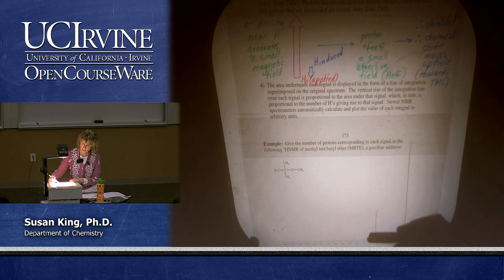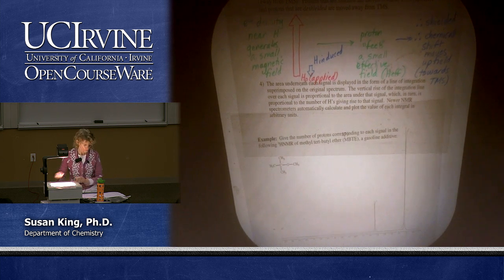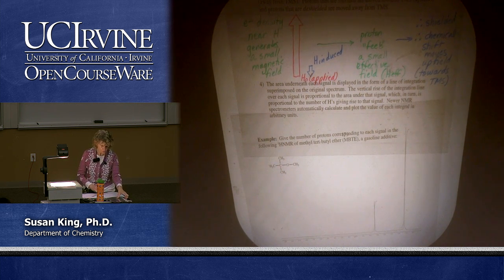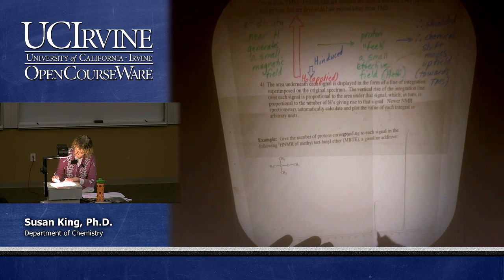And you can sometimes eyeball this. So what this is looking like to me, if this was 1, remember it's the relative ratios, this is 1, this would be what? 3. So that's one way you can do this. You can actually take a side of a piece of paper, and you can just mark this vertical rise here.